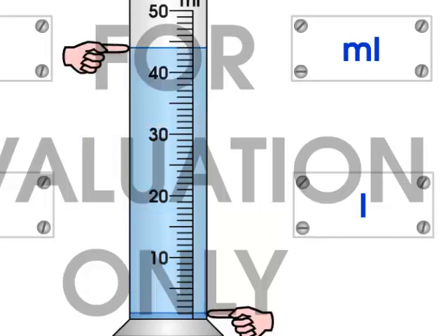Here's another one. We start off with 1 milliliter of water, add our irregularly shaped object, and end up with 44 milliliters as the combined total. So 44 milliliters minus 1 milliliter means our irregularly shaped object or rock would be 43 milliliters.